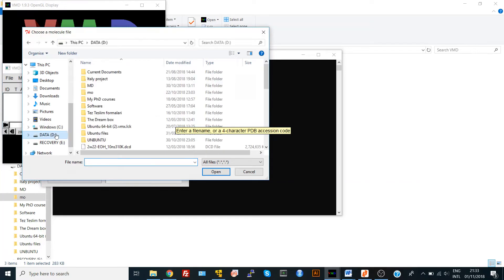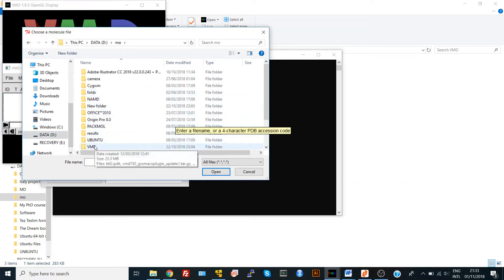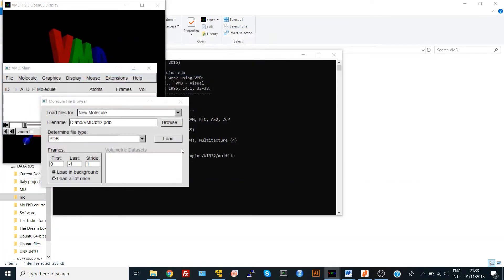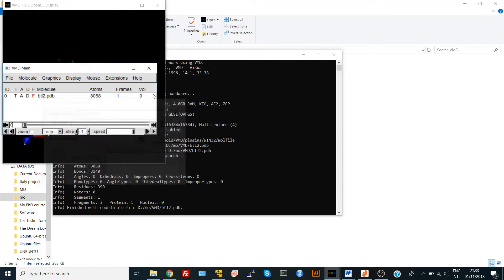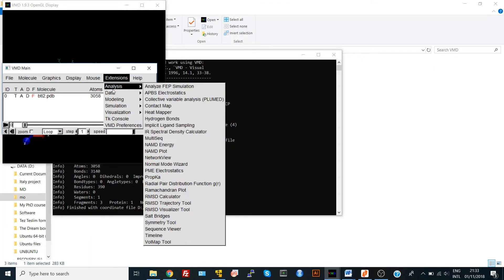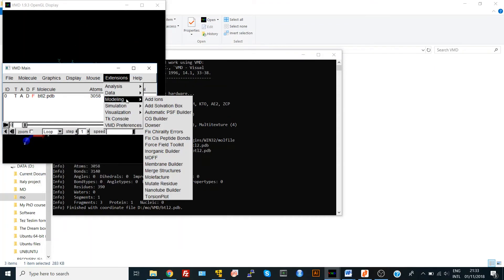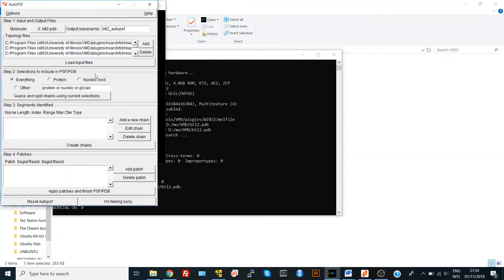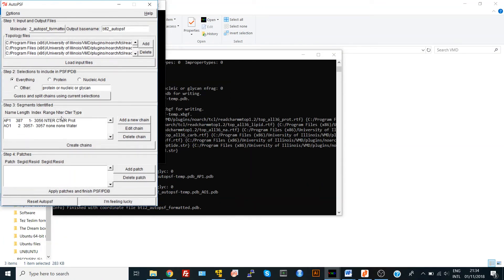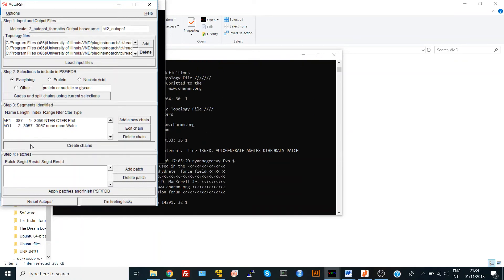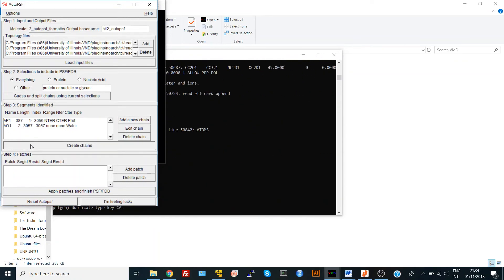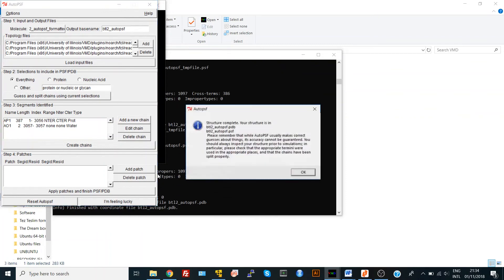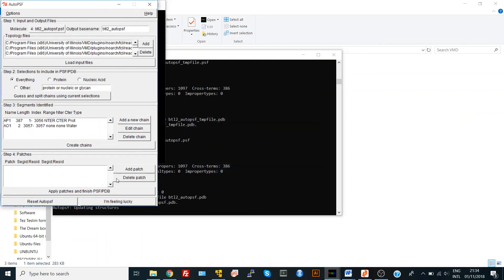Again, go to Modeling, Automatic PSF Builder, loading input files, get my selections and create chains. And here we got our PSF file. That's it.